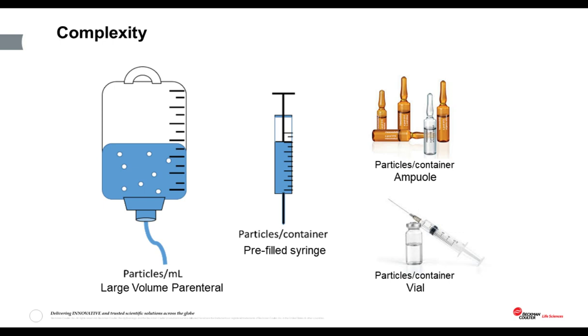Now, as I mentioned, although largely harmonized, the requirements for parenteral drug particulate testing do vary, particularly from product to product. The volume of the sample to be analyzed and the format the results are reported in varies from product to product, as I said in the table. So the sampling requirements for small volume therapeutic proteins, such as vaccines, are very different to those of a large volume parenteral, such as an intravenous drip bag.